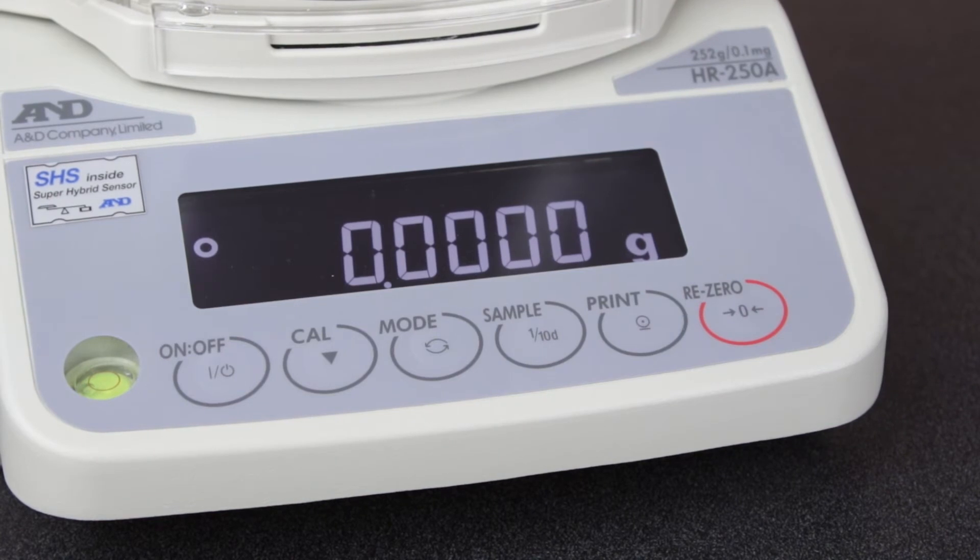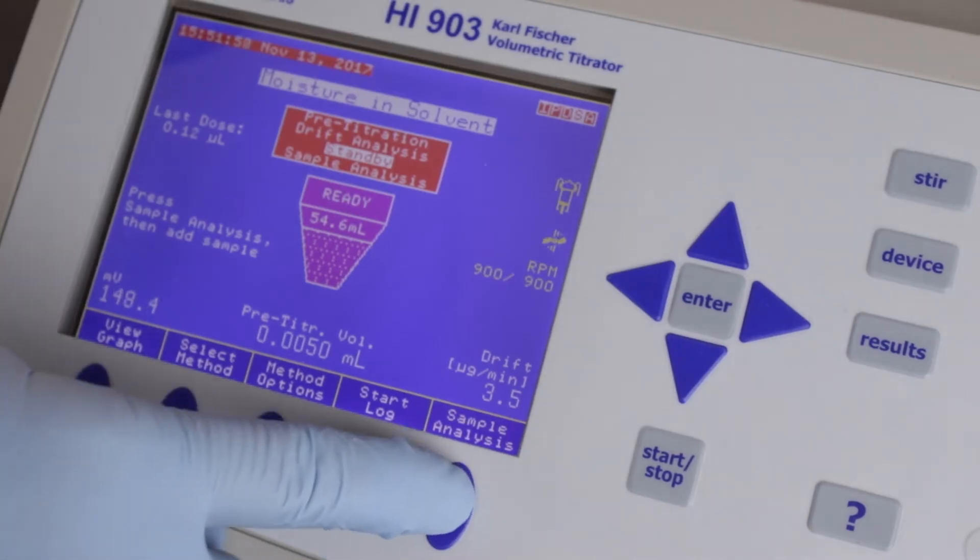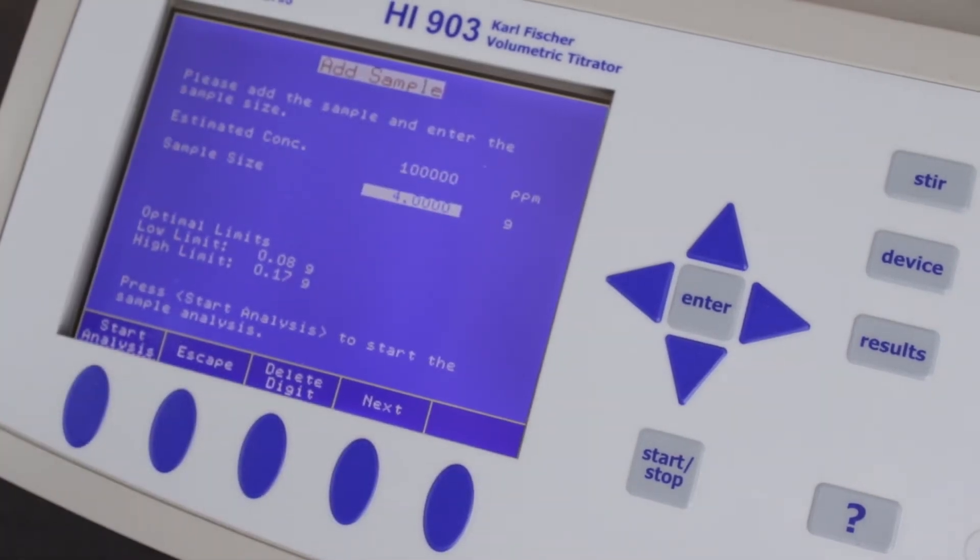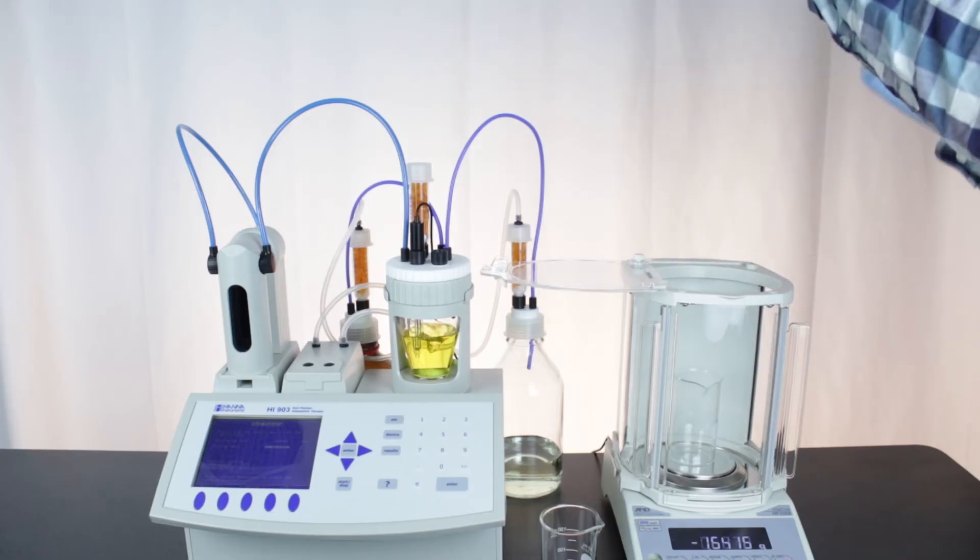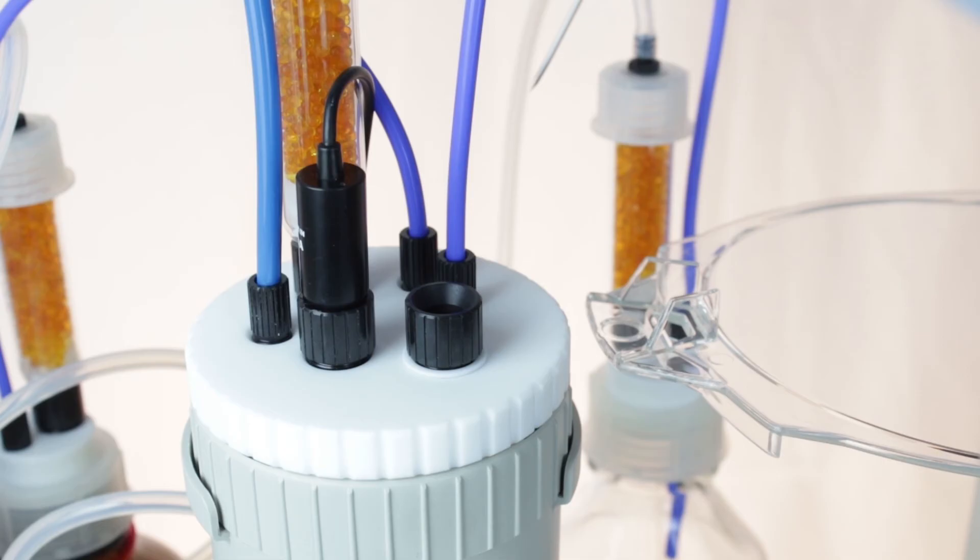Now we'll inject. Press the sample analysis button on your titrator to begin your Carl Fischer test. Add the sample by inserting the needle through the septum and injecting just below the surface of the solvent.